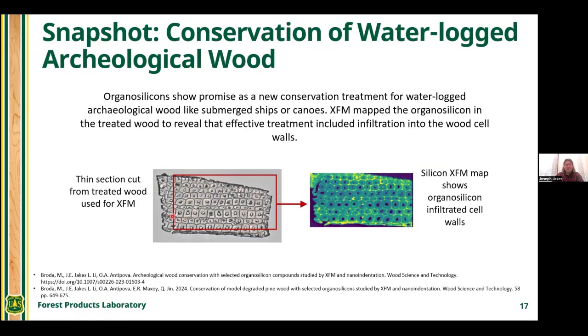Another snapshot here: I was fortunate to have Magdalena Broda, who was here at FPL as a Fulbright scholar. She's from the University of Poznan in Poland, and she's interested in developing new types of conservation treatments for waterlogged archaeological wood based on organosilicons. So she was treating different types of degraded wood with different types of organosilicons, and we were able to use XFM to actually show how much of those organosilicons were infiltrating and entering into the wood cell walls.